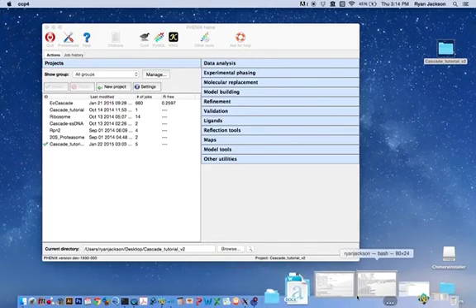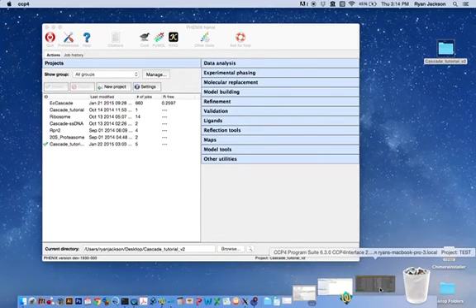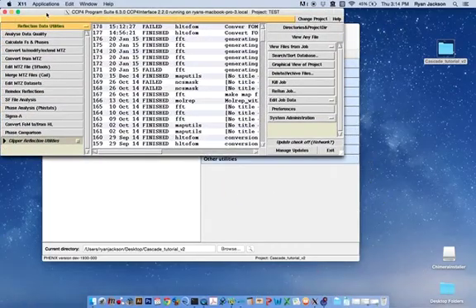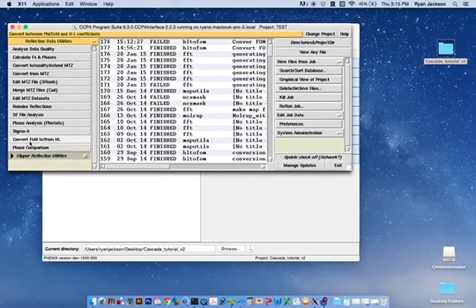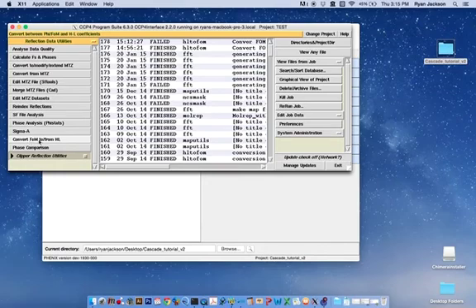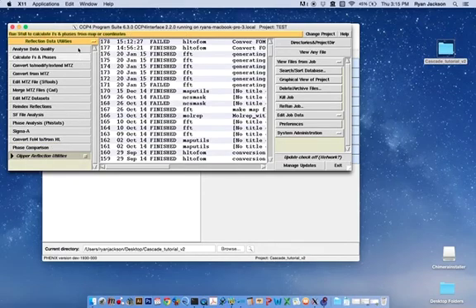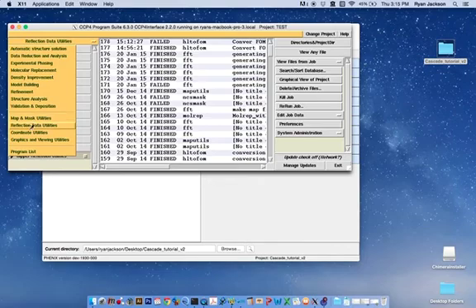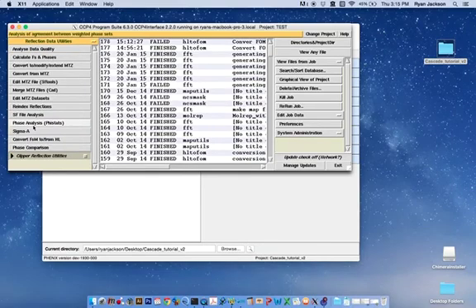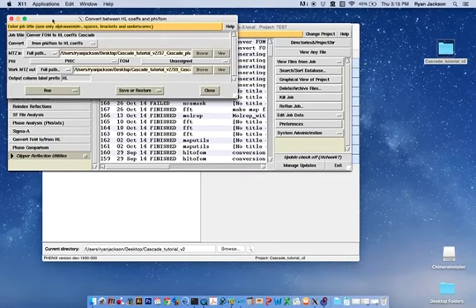CCP4 is right here. The tool we're going to use is the Convert FOM to From HL, which is found in the Reflection Data Utilities.